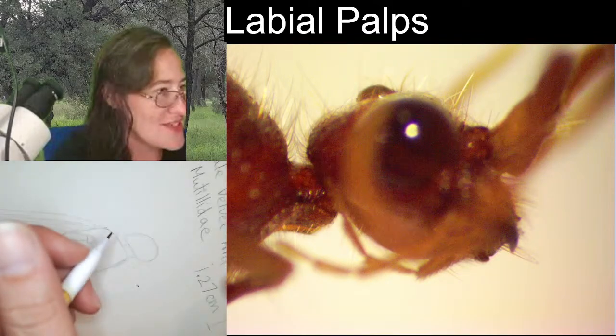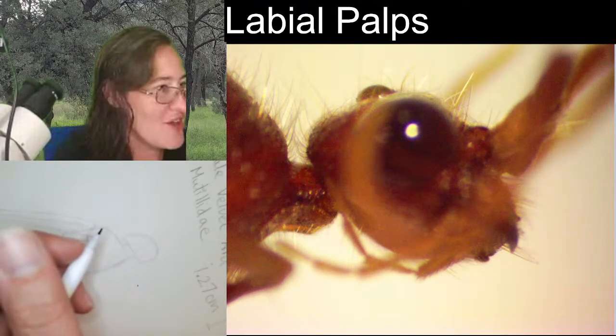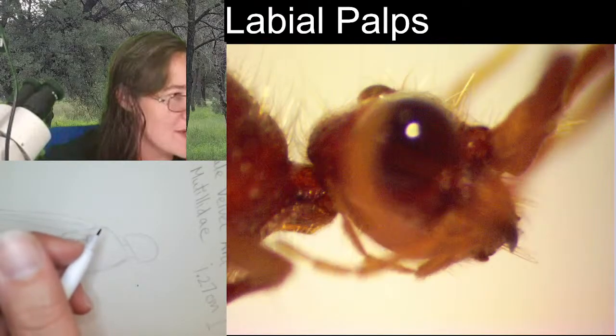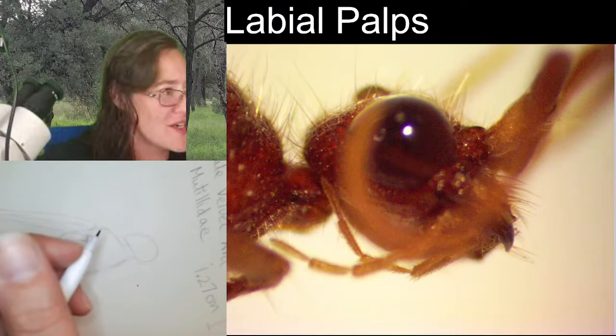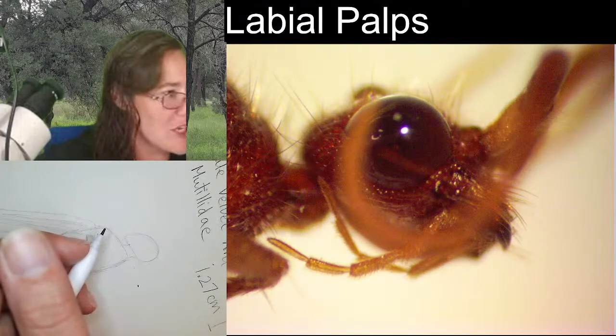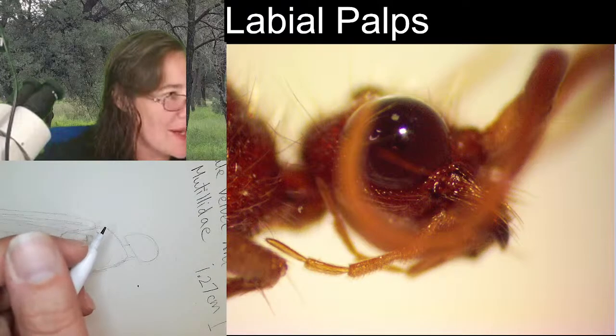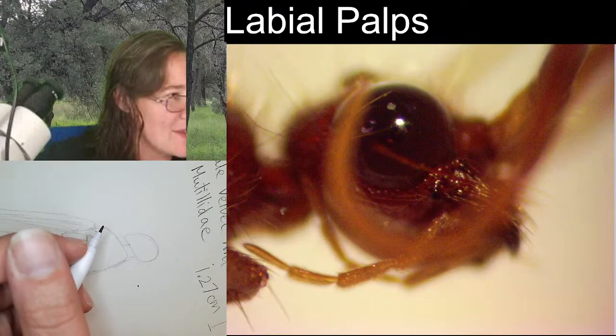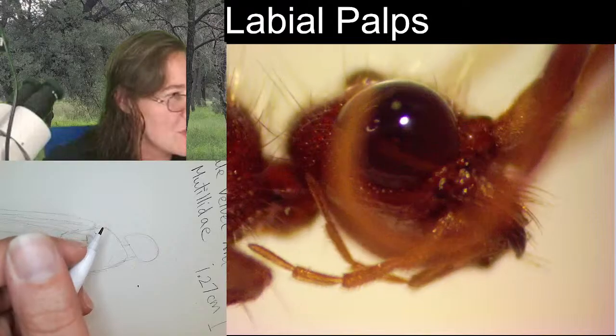Alrighty. So I want to start with the compound eye. That's where I want to start. Sometimes I wish my microscope had a micro focus. There we go. That's pretty close. Whoa, that's something I didn't notice either. I'm learning all types of stuff about this velvet ant.